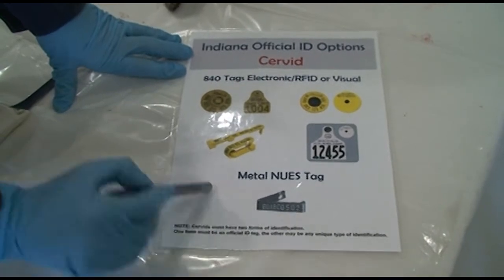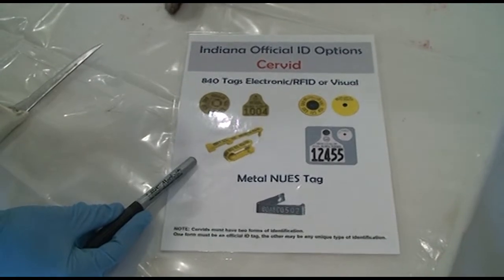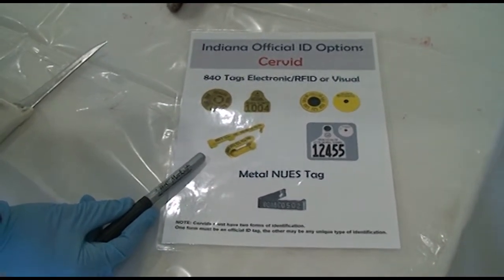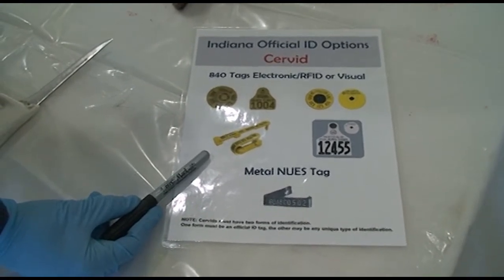So for the sample to be sent, it has to have an official ID. If the deer that you're sampling has lost its official tag, then you need to replace it with one of yours and make a note in your records of what the new tag is that got submitted with the sample.